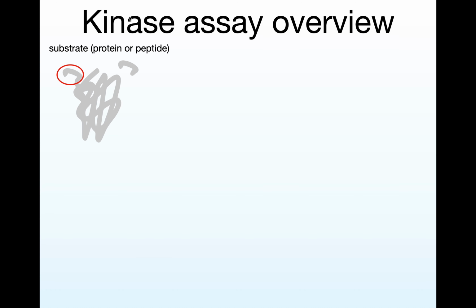Kinases often have a preferred recognition or consensus sequence, a site where they like that order of protein letters, and so they phosphorylate at a specific site on the protein. These are often in disordered or linker regions, linear regions of a protein, not the really structured parts. So you can get away with just using that short peptide.